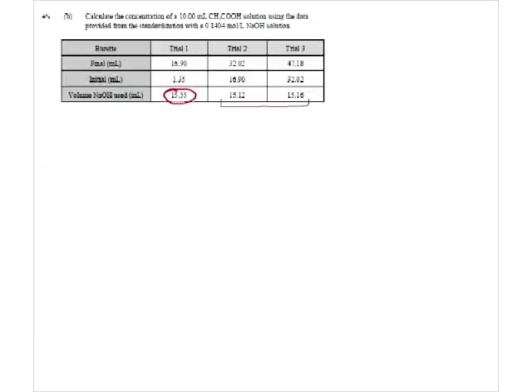Okay, here's a possible calculation that you can do. This is some information that you're going to collect. In this case, we're going to take 10 mL of acetic acid, and we're going to titrate it with some standard sodium hydroxide. You notice we don't know the concentration of the vinegar. We do know the concentration of the sodium hydroxide. We do 3 trials because we want to get the best that we can. We always measure the initial and the final and record it. In this case, the first time we did it, we got a difference of 15.55 milliliters.